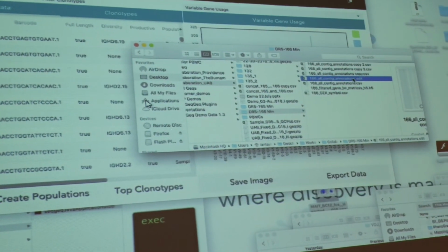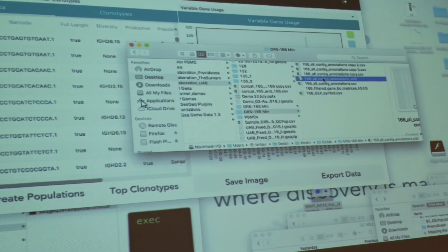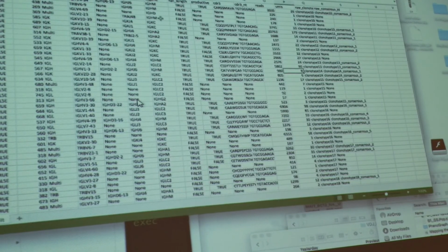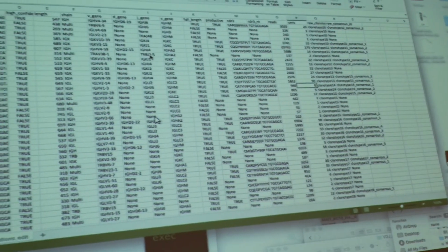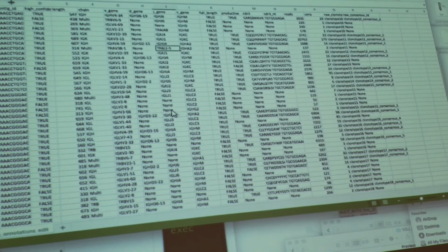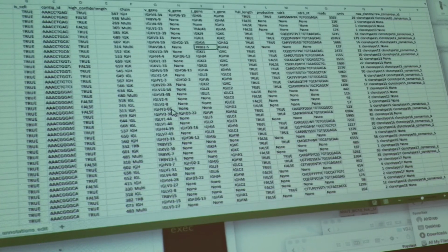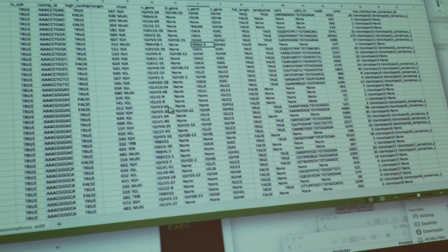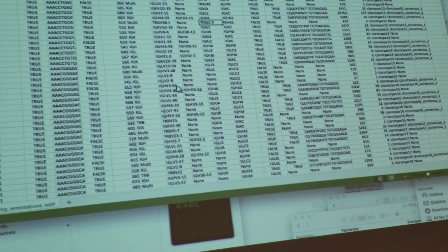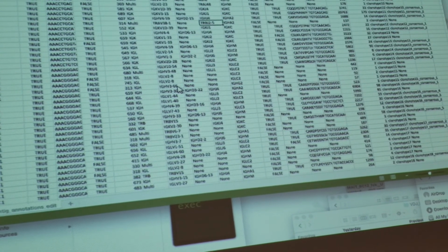I think it must be this file. You can see that in the J gene, we have dashes, not dots. But in the barcode, we have dots. So that's what I did wrong there. I should have been loading this edit dots, or the CSV file that contains that edit string.